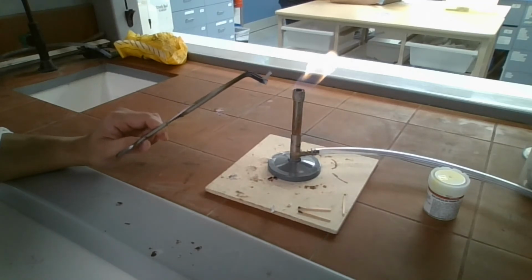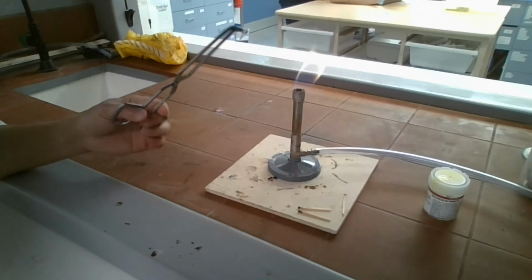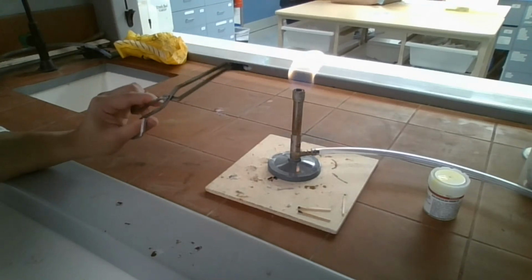After the reaction, what was left? Well, that white powder that I was talking about, that's the only thing that was left. Well, from magnesium and oxygen, what can you make? Well, this white powder, what do you think this was?